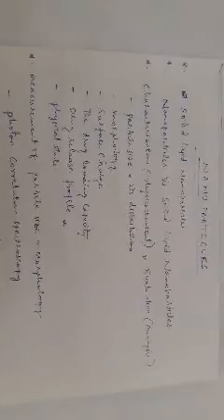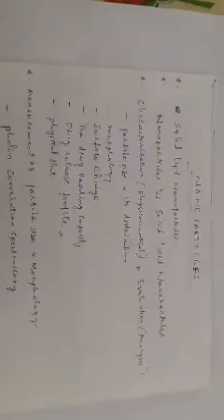Let us now discuss why we have to use the light scattering principle only for various measurements using the Zeta sizer. There are various types of light scattering, each designed to provide useful and actionable physicochemical information on the sample being analyzed.